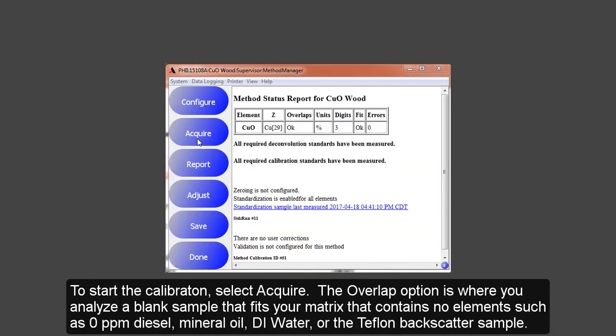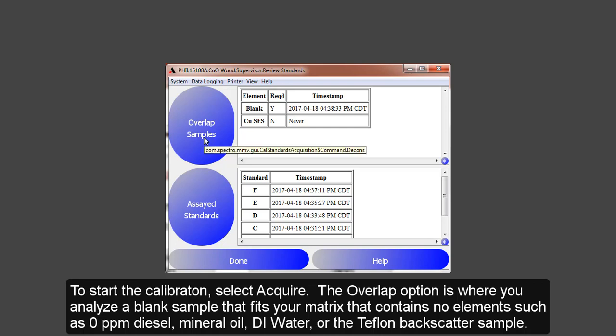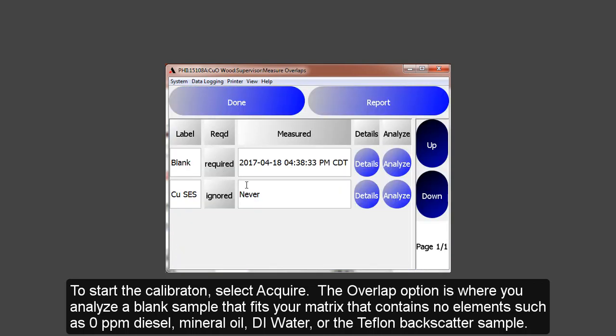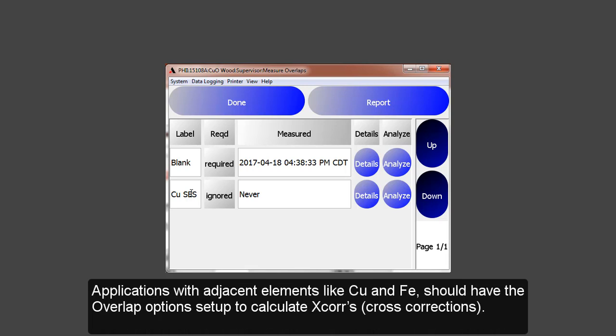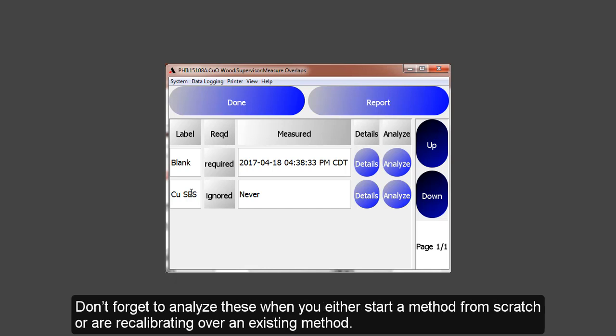To start the calibration, select Acquire. The Overlap Samples option is where you analyze a blank sample that fits your matrix that contains no elements, such as a blank or 0 ppm diesel, mineral oil, DI water, the Teflon backscatter, or the polyethylene backscatter. The SES refers to the single element sample. For a single element application, this sample does not have to be analyzed, or in applications where the element energies do not overlap, like sulfur and vanadium. Applications with adjacent elements, like copper and iron, should have the overlap options set up to calculate under the cross-corrections. Don't forget to analyze these when you either start a method from scratch or recalibrating over an existing method.